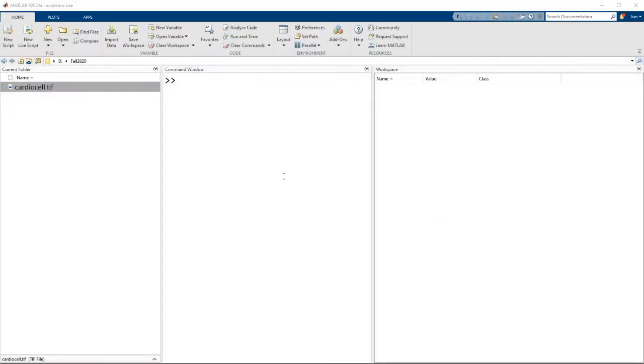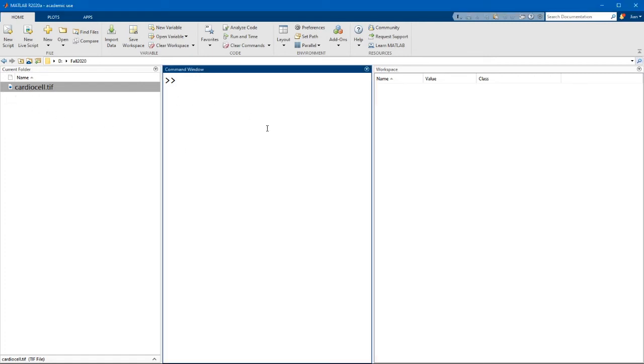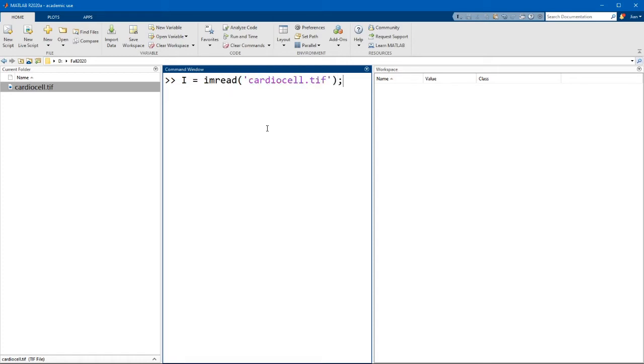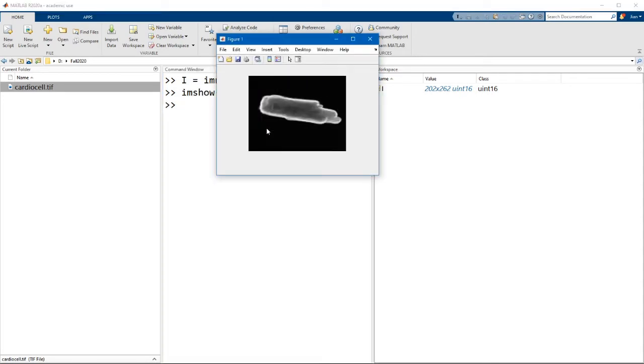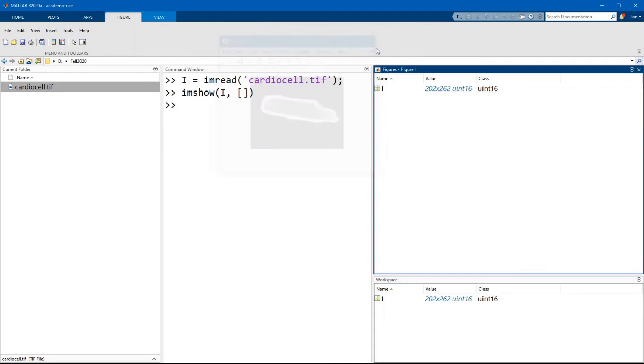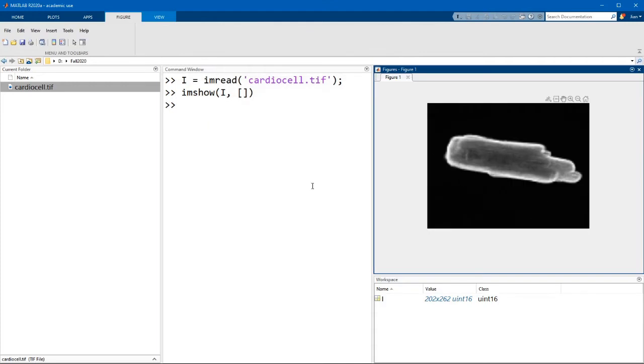The example image I'm going to use today is called cardiocell.tiff, which is an image of a cardiomyocyte or heart cell. As you might remember from last week, we can use the imread function to read in the image, and then we can use imshow to display it. Now I'm going to dock this image so we can see it while working in MATLAB.